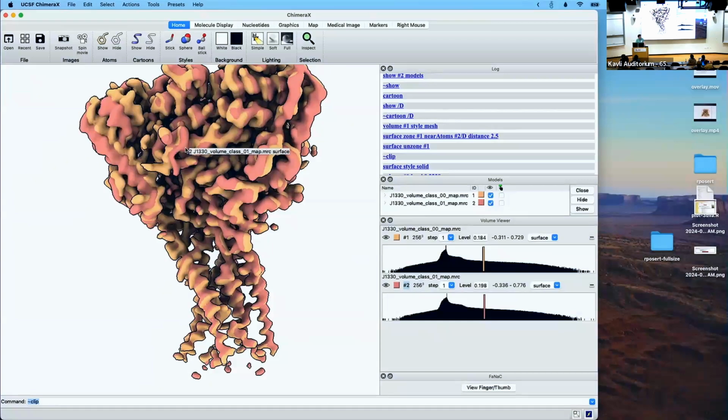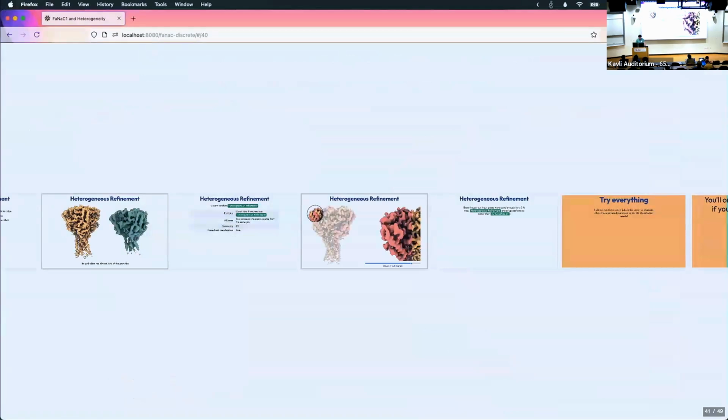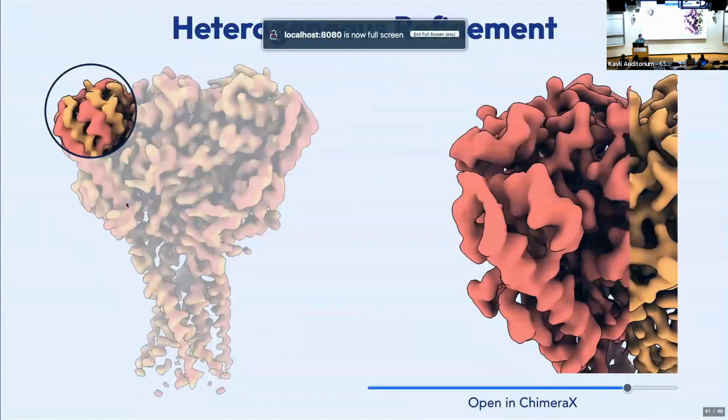Hi. So when you're doing these classifications, how much do you play with the class similarity value rather than hard classification, or is it always just filter resolution? So that's a good question. The question being, how much do I lean on class similarity versus hard classification?